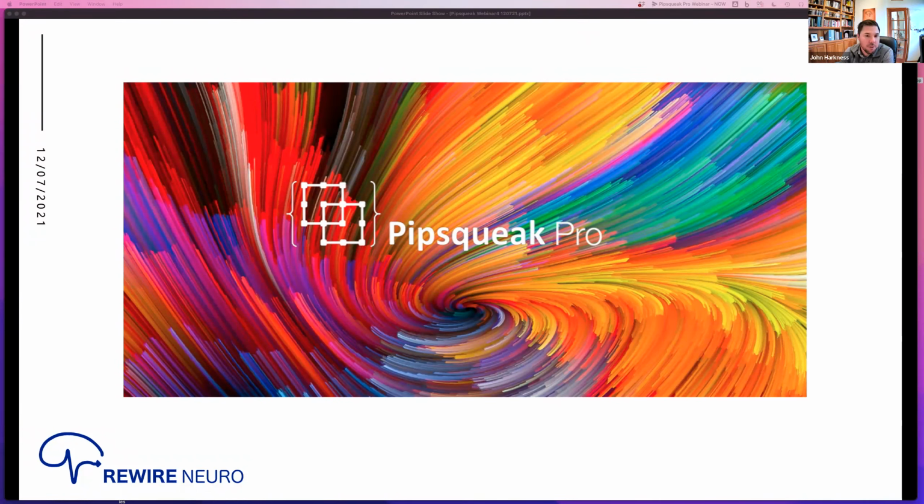I'm curious, for those of you who haven't used Pipsqueak before, what do you use currently to do your image analysis or cell counting? Feel free to hop on camera or pop that into the chat, but I'd love to know what you're using.